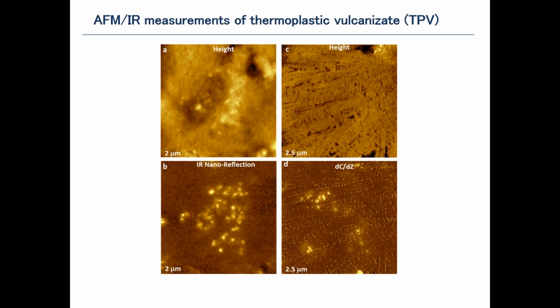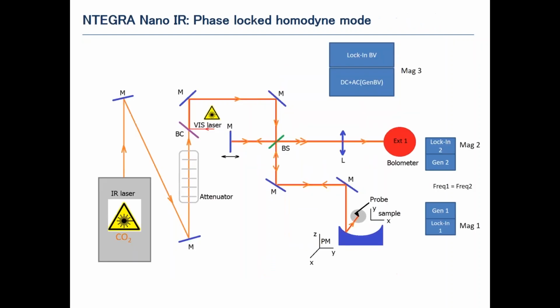Well, all the images mentioned above were measured in the so-called two-pass mode, when you first measure the reflection and then measure the absorption contrast of the sample. To go from the first measurement to the other, one needs to move the base mirror of the microscope interferometer to change the optical phase of the incident light, first of all. And secondly, in all these images, we need the reference to understand where the initial phase is.